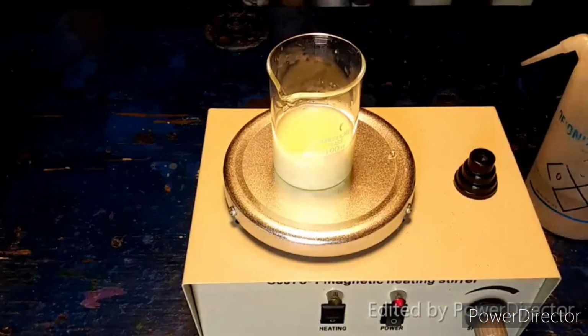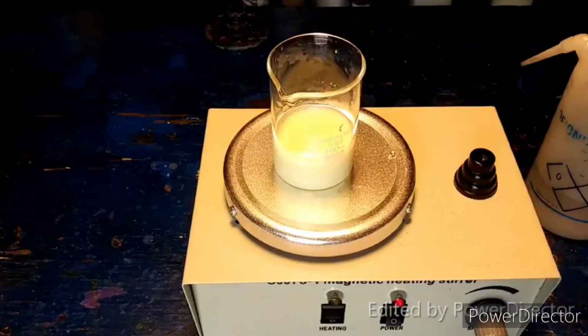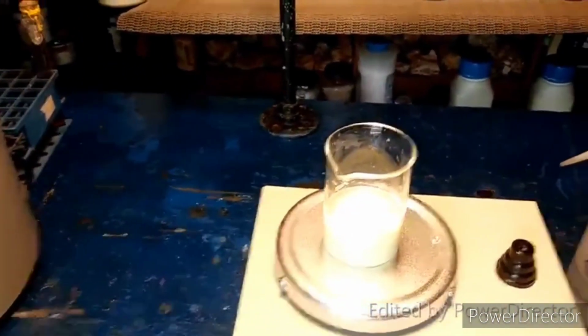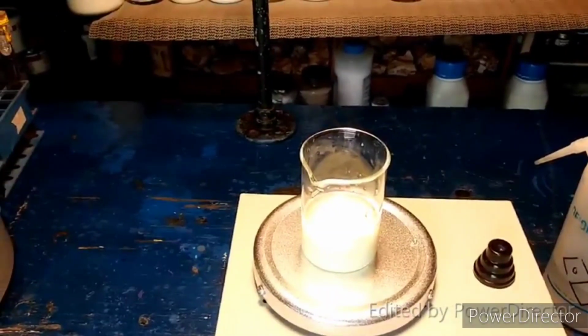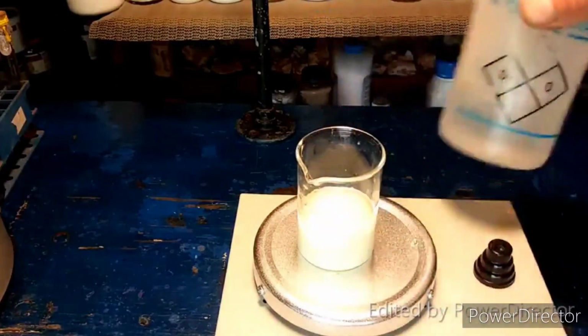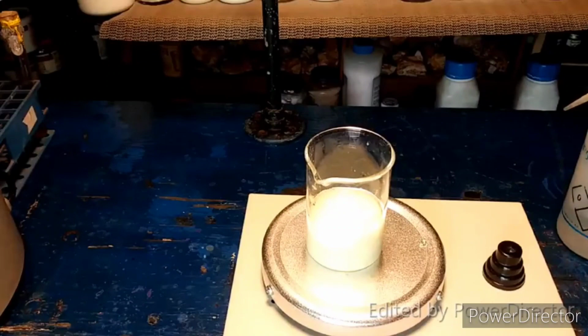Alright, what we're going to do now is I'm going to take this mixture here, pour it into a couple of tubes, and then I'm going to centrifuge it in order to remove the barium sulfate. We could filter it, but barium sulfate is very insoluble, and because of that, it ends up making very, very small crystals that can go through even cotton plugs in a funnel. So it's very difficult to actually filter it and remove all of it. So we're not even going to mess with that. We're just going to centrifuge it and make our lives easier.